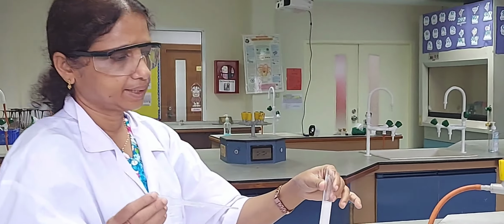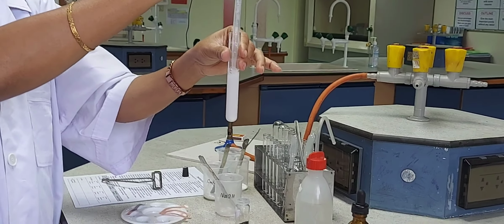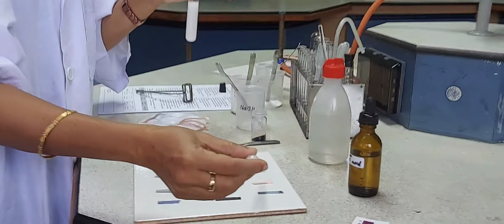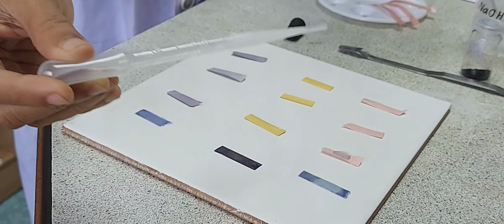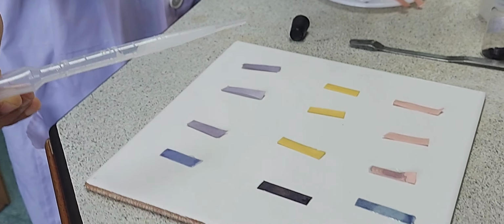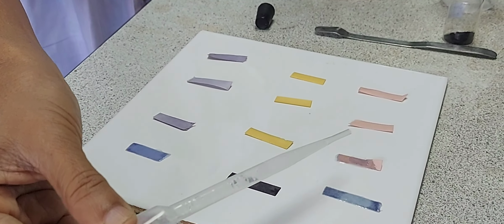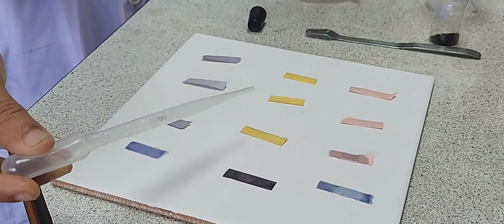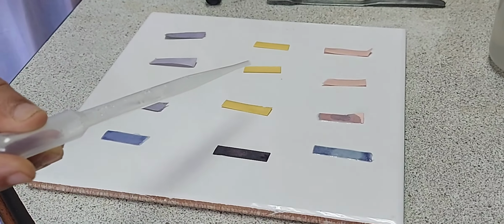So now you can see the separation happening. I will take a little of the solution and then add it to the litmus paper, red litmus paper, see what happens. It's changing to blue, so indicating that it is not so obvious, but it is still changing to blue. So it is an alkali formed, but it may not be a strong alkali.